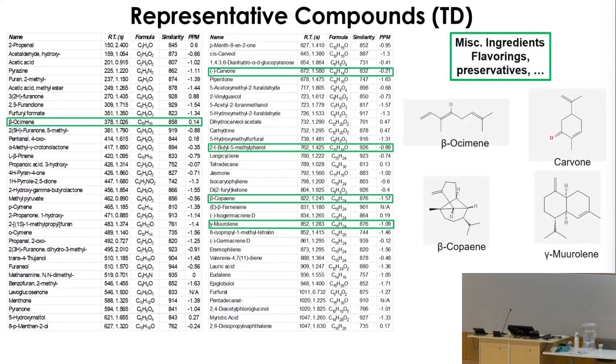I also have flavoring components. This particular gum, this wasn't the citrus one, this one's a spearmint one, handed to me by our product manager. Yeah, that's this sample, that spearmint gum. So it's not surprising that you have monoterpenes, you have sesquiterpenes, you have diterpenes, and all those good things that you find in essential oils. And you also have preservatives, as I showed down below.